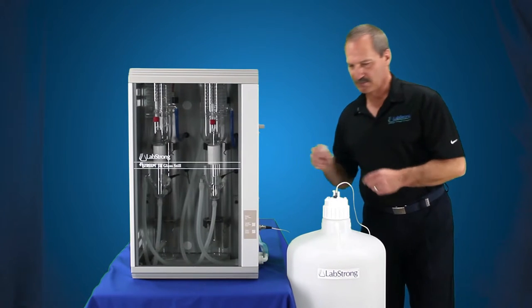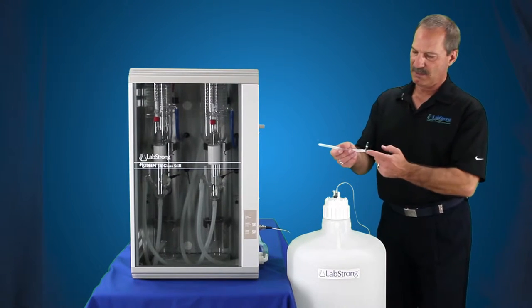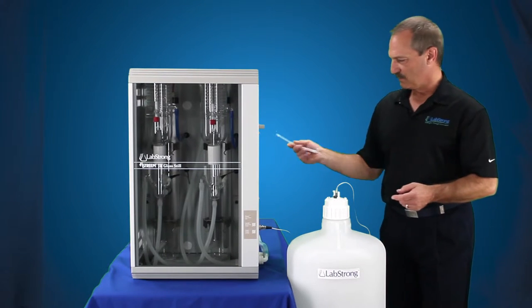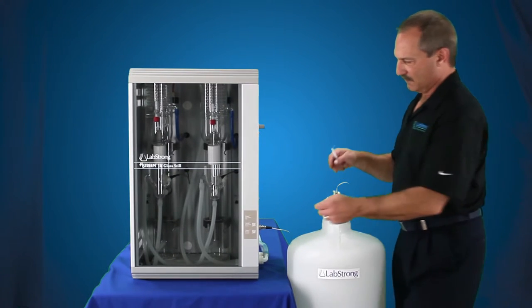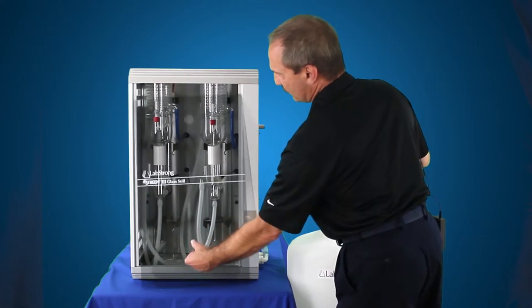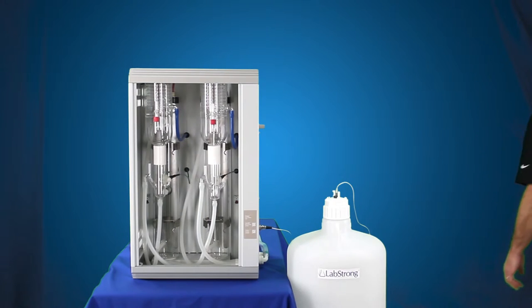Next thing you want to install is our elbow and our T-fitting for our distillate to come out, and then we're going to connect up the tubing to the float switch assembly. Just lift the door up, pull out on the bottom, pull down on the top, and put that aside — we're going to reuse that.